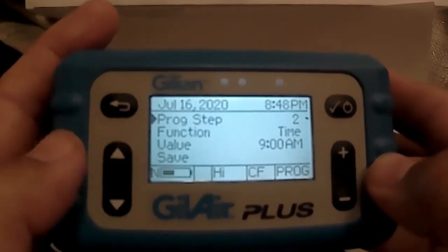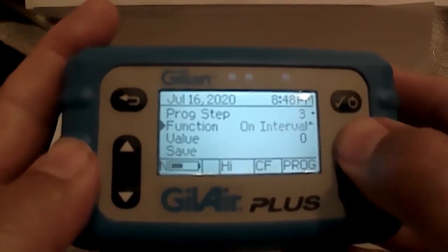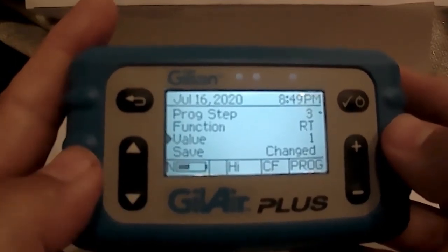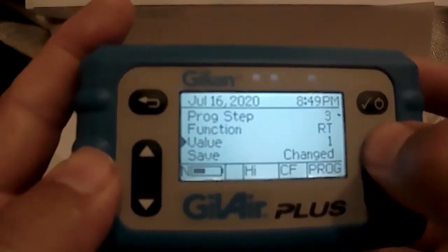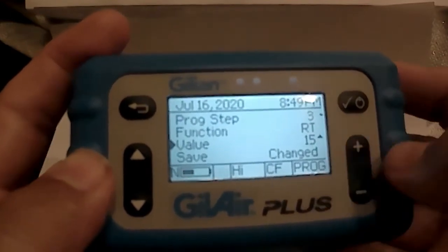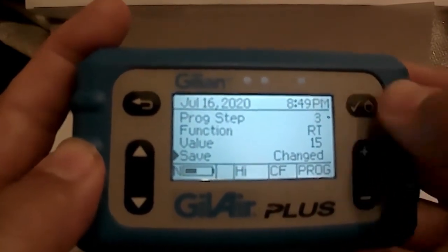Now we want to set the run time, so go up to program step and advance it to step three. Hit enter, arrow down to function, and use the plus key until we get RT, which stands for run time. Hit enter and arrow down to the value. The value defaults to one minute and you can advance using the plus key to the desired amount of time. For our purposes today we want it to run for 15 minutes. Hit the plus key to 15, then hit enter to save that time, then arrow down to the save function and hit enter to save step three.